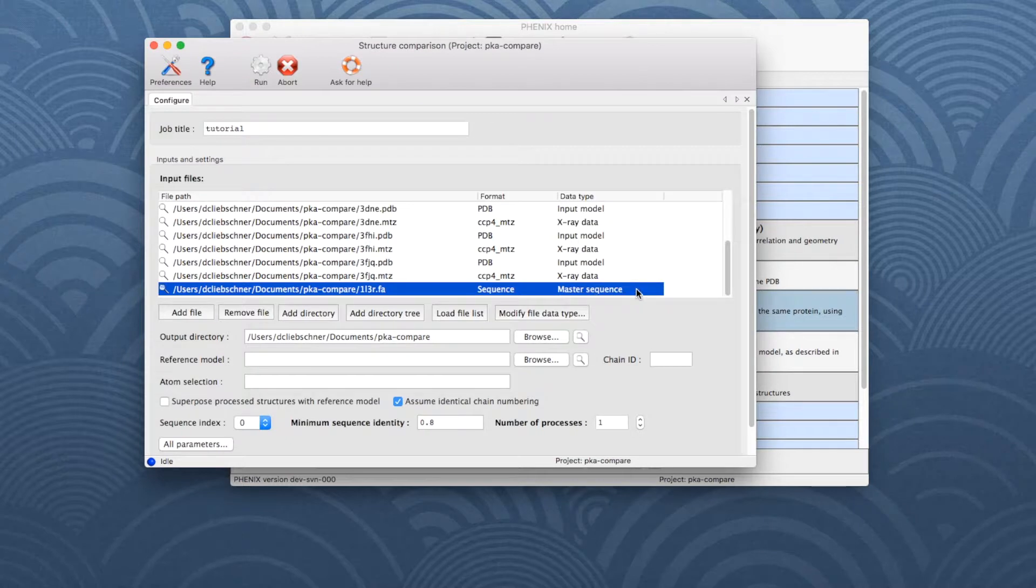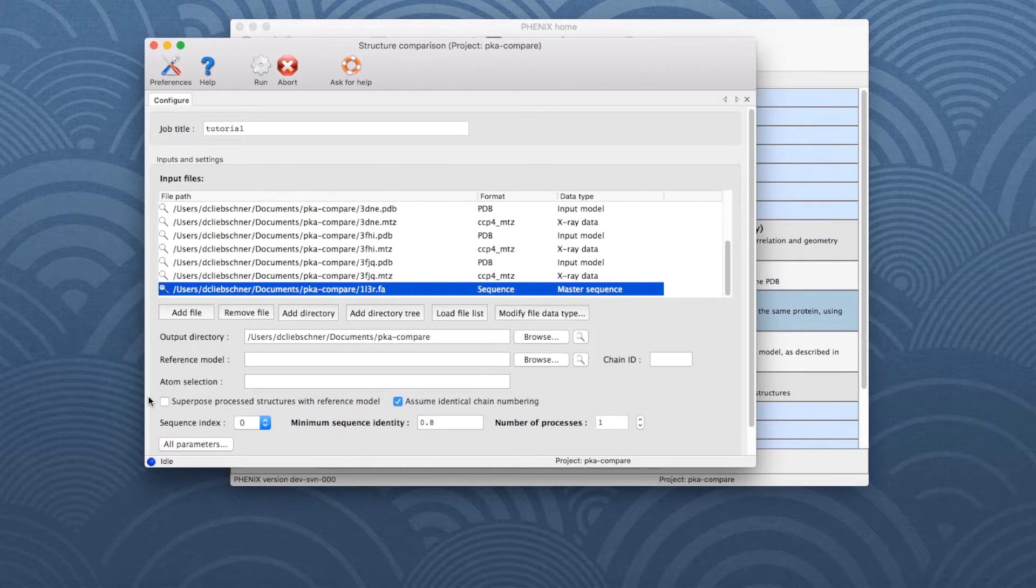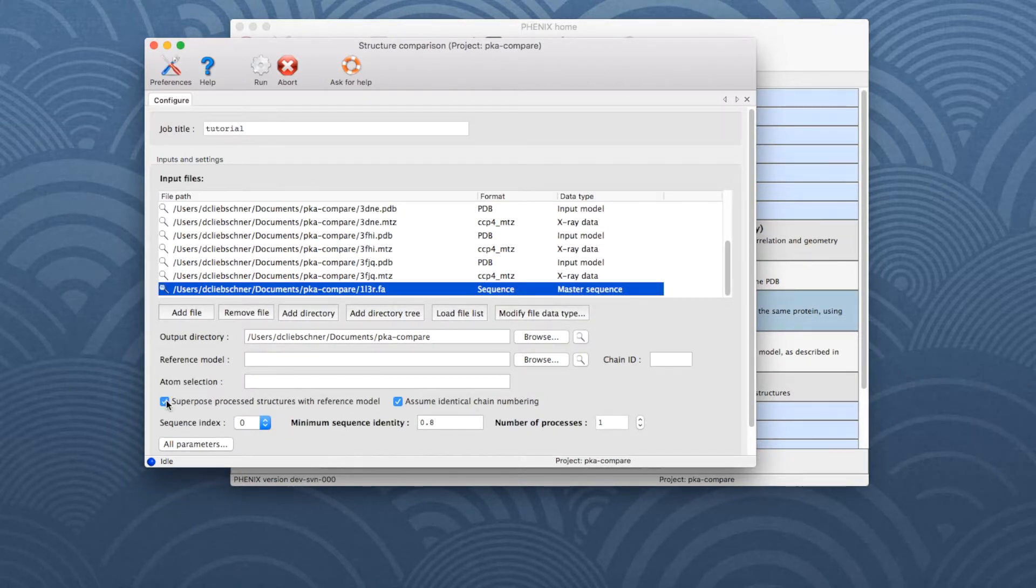An important choice is whether to superpose the structures onto the reference. If this option is enabled, all similar chains and their density maps are superposed onto the reference. The results of the comparison are the same, but the graphics window will show all chains superposed. Let's activate the superposition for this example and then click Run to start the program.